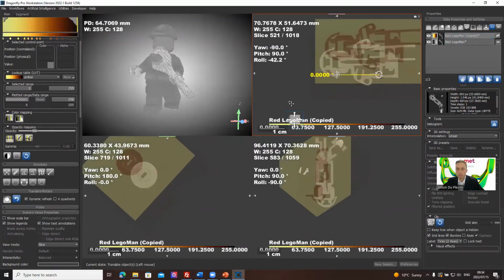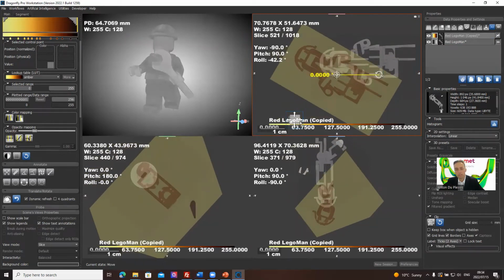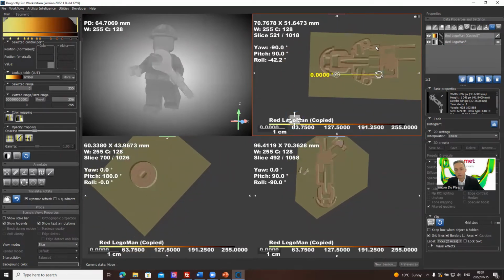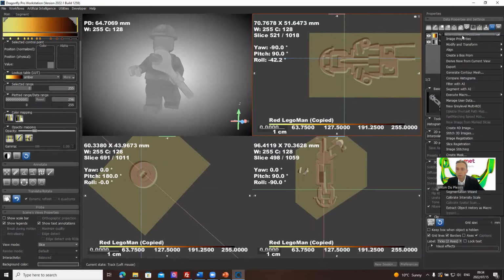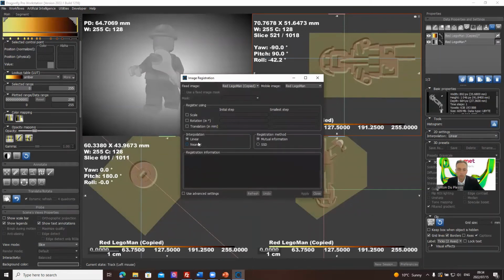Now, if one is on top of the other one, let's say we scanned two objects. Now you can turn it like this, and we can move it closer together, and we can optimize the alignment a bit manually. And then you can also do an image registration. It's maybe a bit advanced, but you can do an image registration. Let's just try it. Should be working fine.